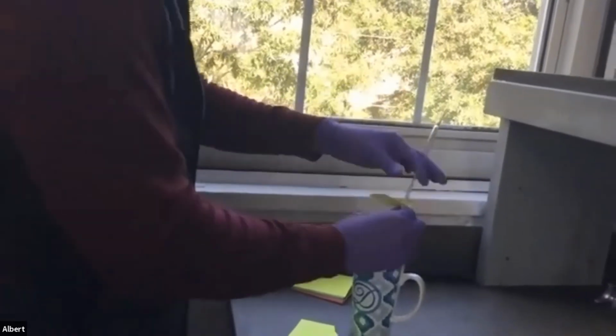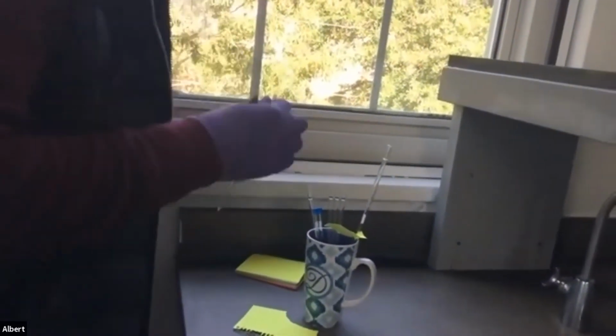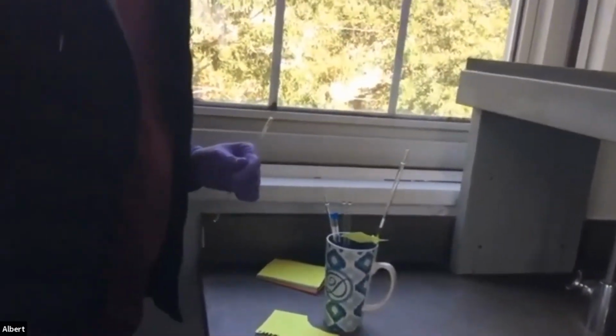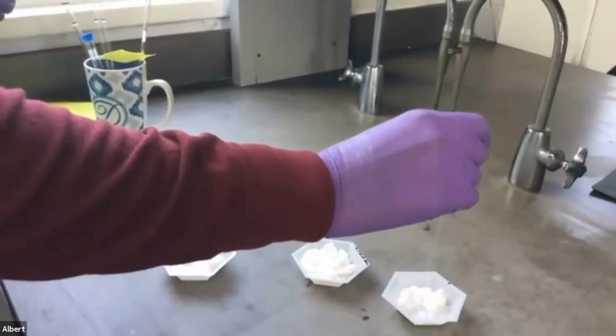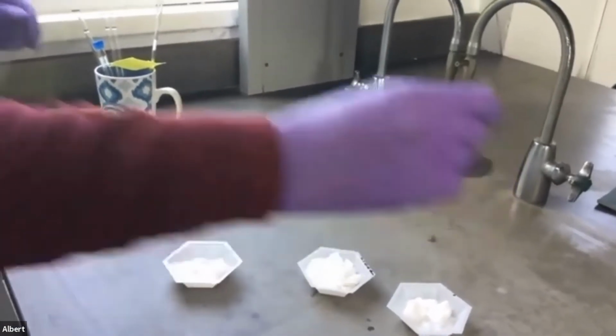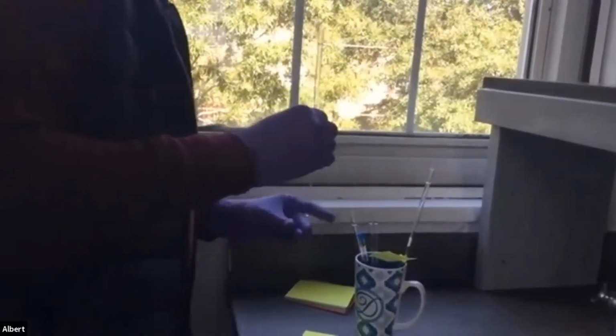So that's that, and then we're gonna make up another sample of sample 1. Same thing, pipette into the sample. Like that. And I only need a little bit, right? So that's plenty. Milligrams, I only need milligrams of this stuff. It doesn't have to be all super concentrated.